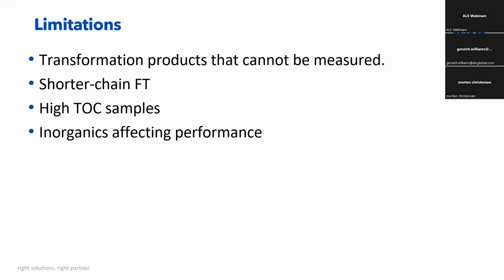So those are not picked up by the conventional methods. And because of this known issue, we're starting to look at developing a method for the ultra shorts, where we would be able to determine these kind of C2, C3 PFAS. So that's something we're looking at in the future. It's not something we're offering at the moment, but it's something we're certainly looking at.